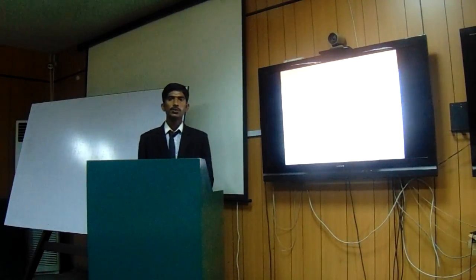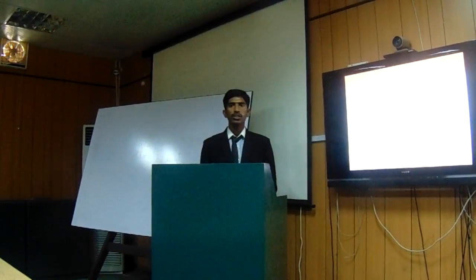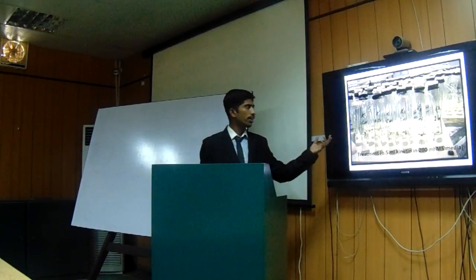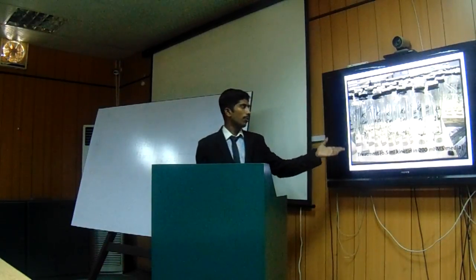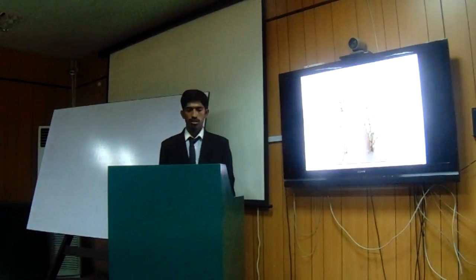Meristem culturing. What is meristem culturing? Cutting a small portion of stem such as a node, transferring the stem portion into a test tube which contains MS media, covering it with a lid, and tying it with a rubber band. Here you can see the diagram of the incubation room. You can compare these pictures which contain different concentrations of kinetin.